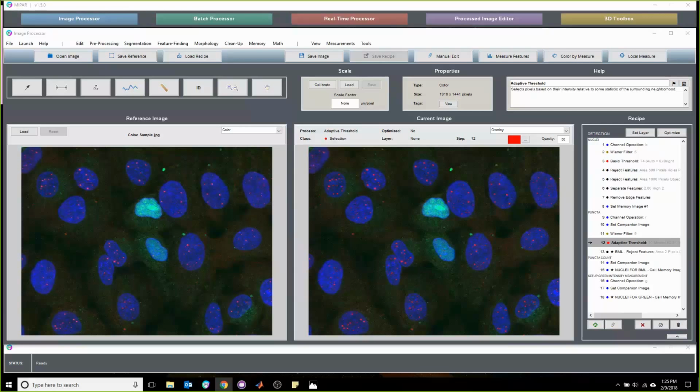It's difficult for me to say because I am pretty new to image processing, and MIPAR is really all that I've used. I have dabbled with ImageJ a little bit, but what makes MIPAR stand out is not only that everything is in a nice package where everything is laid out nicely and you can see clearly what each step is doing, but the recipe framework and the batch processing mean that once I get a recipe figured out, I can edit any steps back instead of having to go all the way from the beginning. That's really what makes MIPAR useful for our purposes.